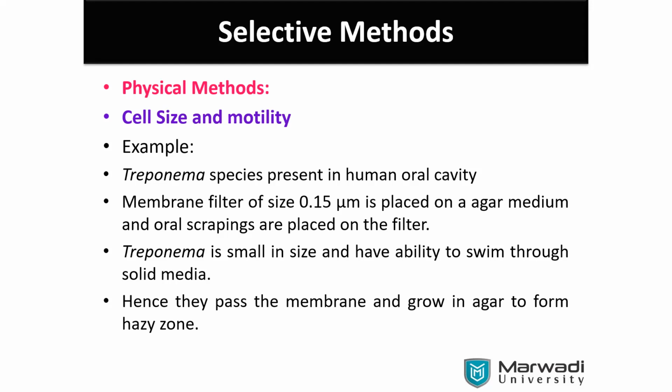It requires the nutrient agar or the soil sample suspension you have prepared, at least in liquid form. You need to put a drop over it and cover it with the cover slip, so your drop is there within it. I'm going to put the cover slip.